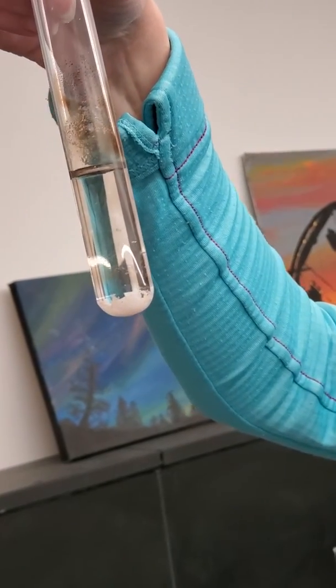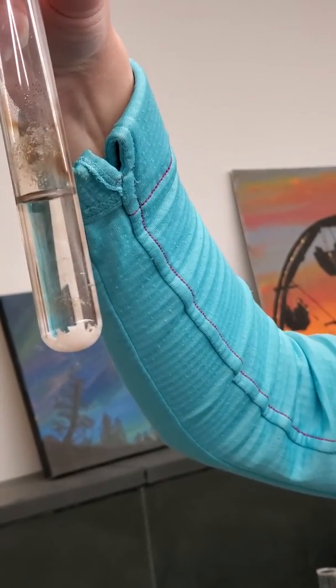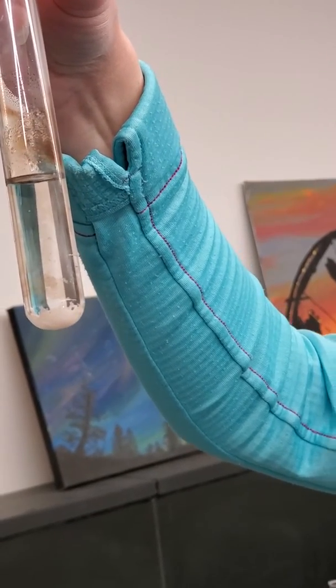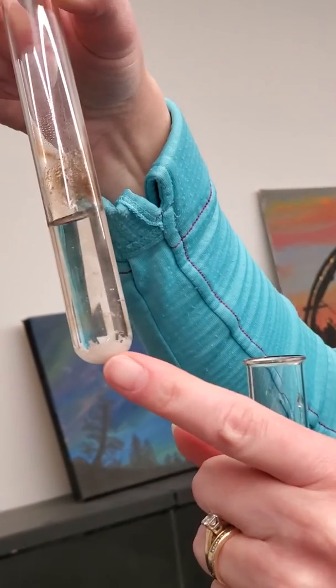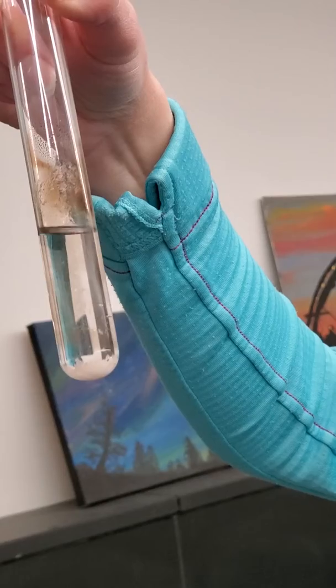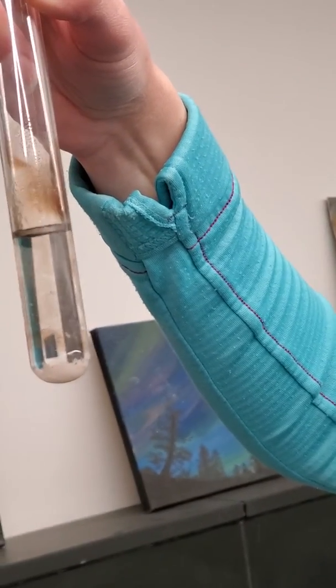The trick is to be able to figure out which substance is the solid precipitate and which substance stays dissolved in the water or in the aqueous solution. There are some solubility rules on your lab that will help you decide what is the solid product, the precipitate, and what is the aqueous product, the aqueous solution that is clear at the top. So good luck with that one. That is our 5th reaction.